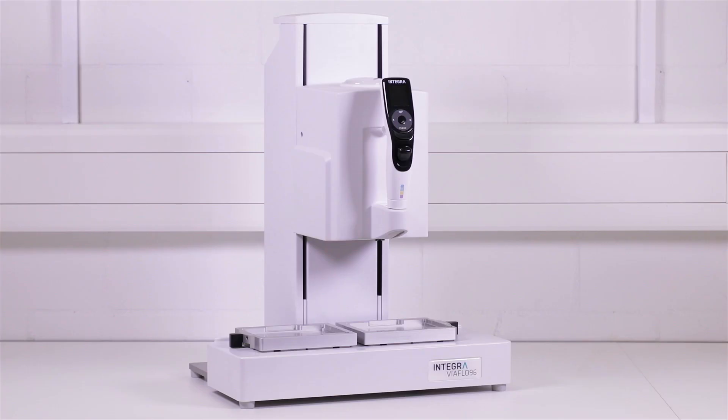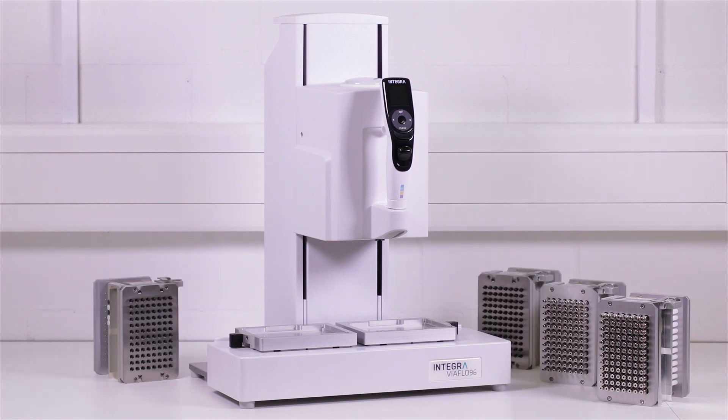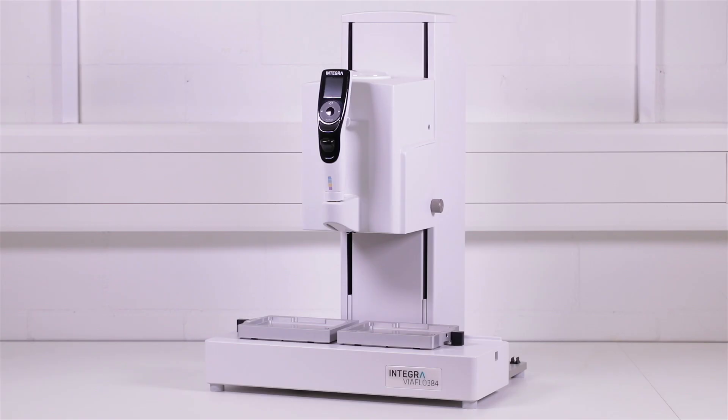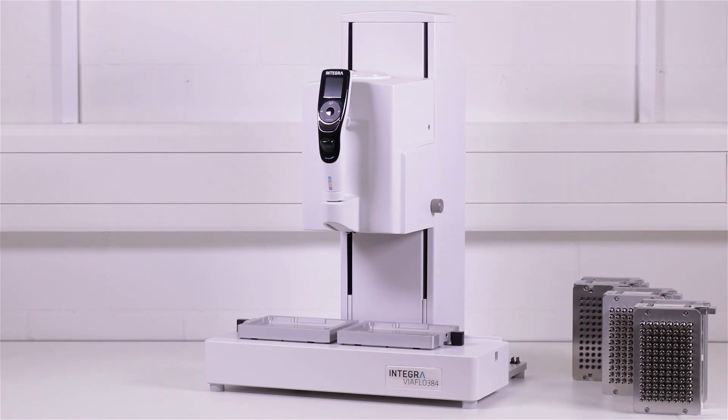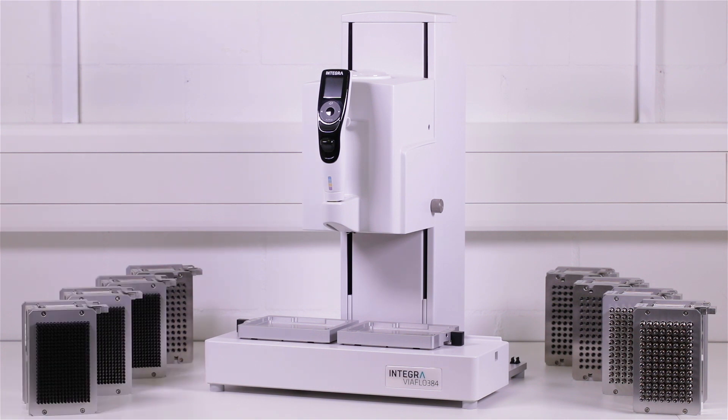Two different base units are available. The VIAFLOW 96 offers 96-channel heads in five different volume ranges. The VIAFLOW 384 accommodates 384-channel heads in three volume ranges, offering even higher throughput and possibilities.